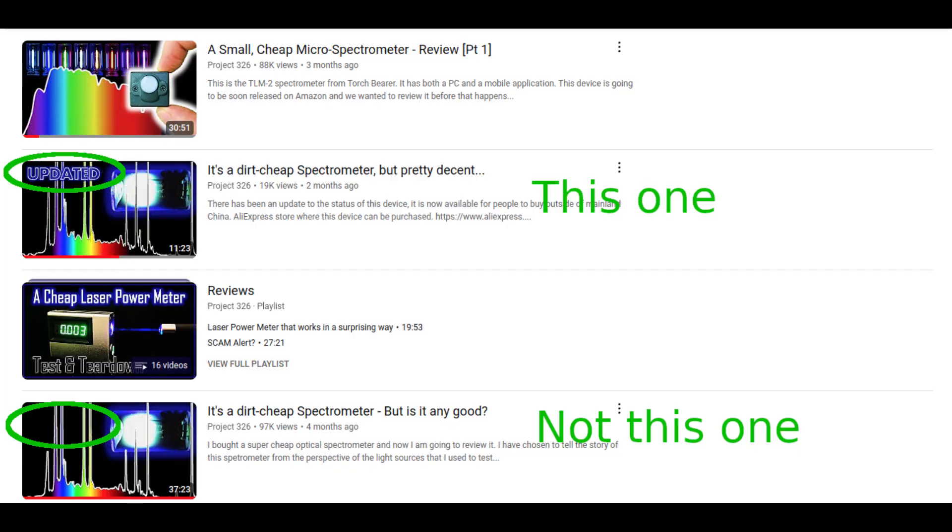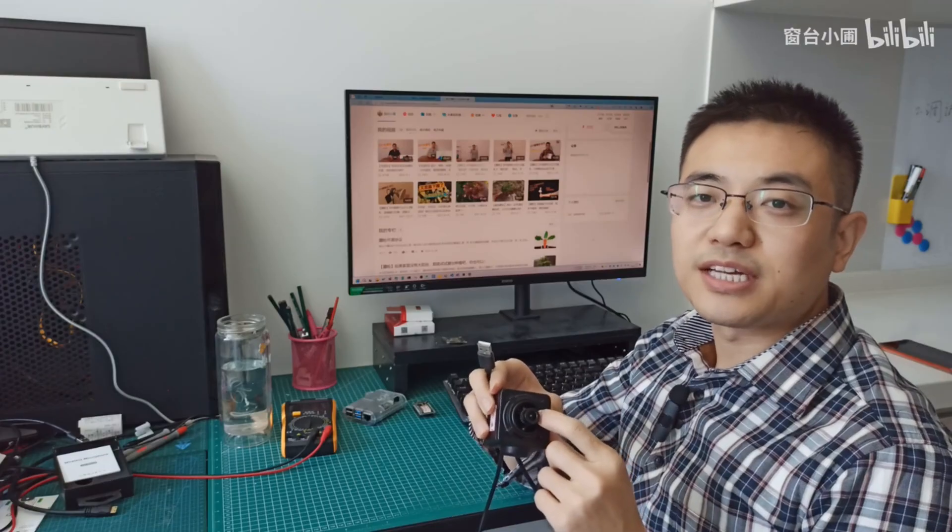Before buying it, I watched a review and learned that these are made by Lau Kang, and he hand scrapes off the color Bayer filter to convert a color webcam into a grayscale one.